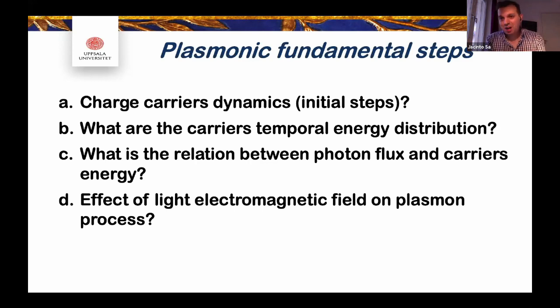Some of them are quite even unpredictable. We always think that as the photon flux increases, you go for kind of a second order behavior. But depending on where you hit on the plasmonic resonance, if it's more intraband or it's really at the plasmon resonance, this behavior is quite different. So it's important to understand this, but you need basically techniques that will measure down to 5 or 6 femtoseconds.